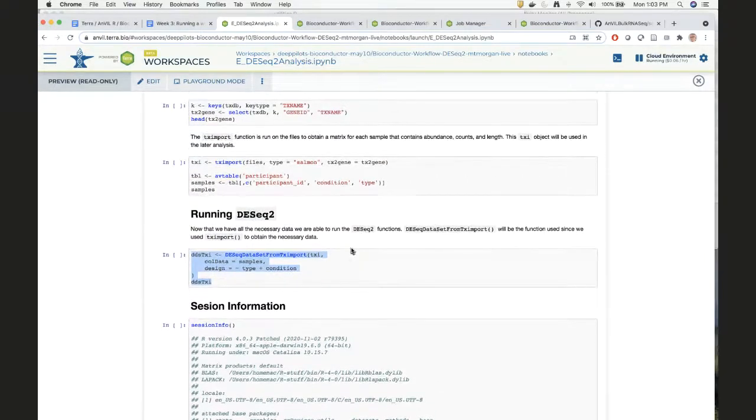So the 2 notebooks that we, of course, didn't get a chance to work through, bring the files from the Google bucket where they're produced by the workflow to our local runtime, and then incorporate them into the data structure that we need to run the workflow.